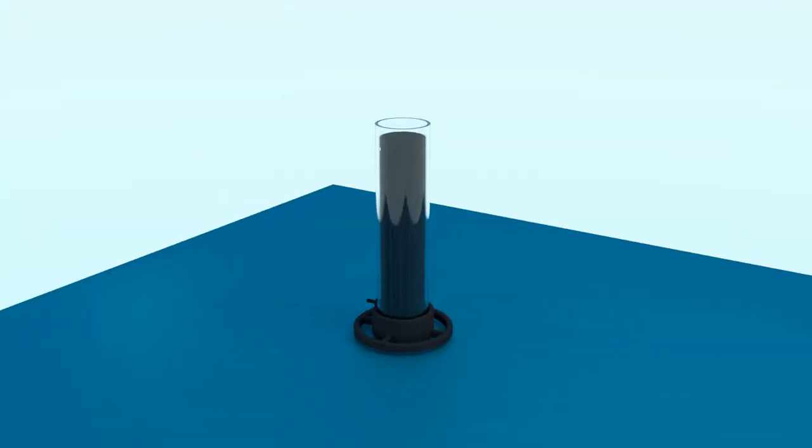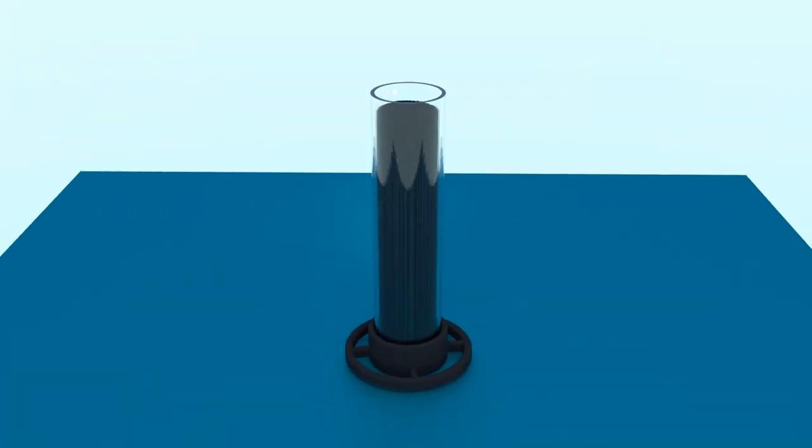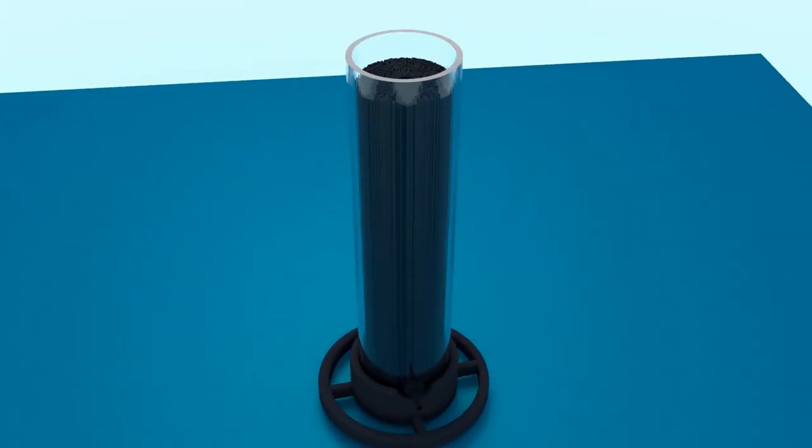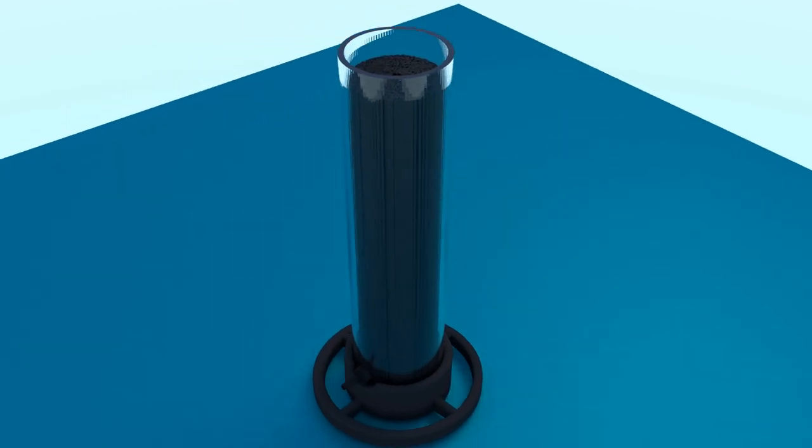Fume scrubber and treated activated charcoal are available separately.